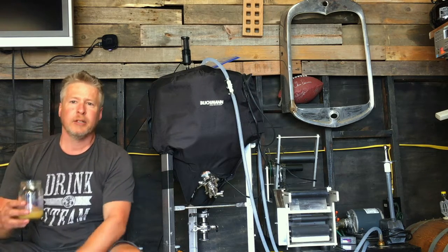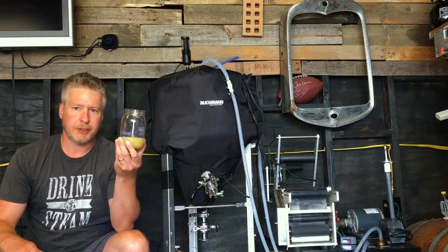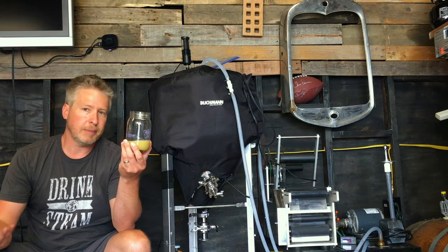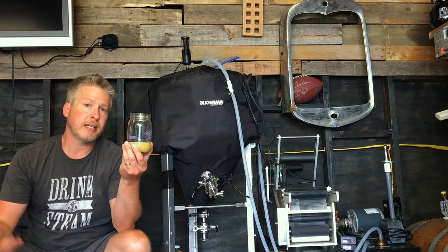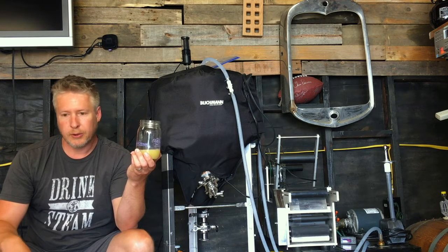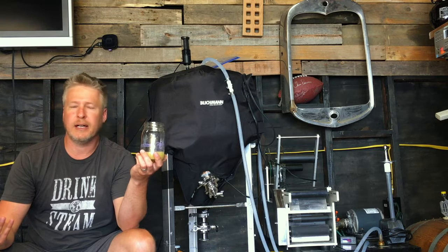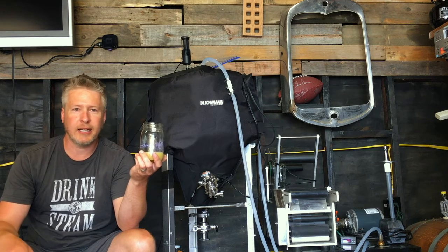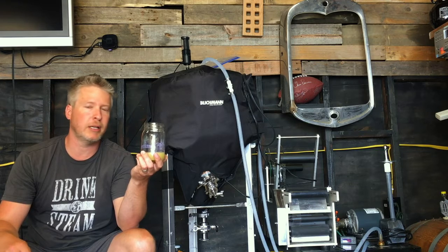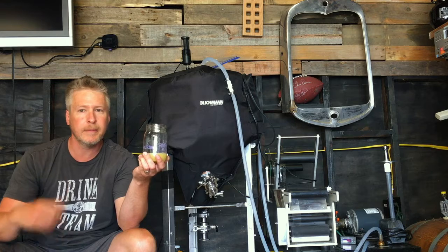So we've got our sample here. We did our temperature, and the temperature is also good to note because when we do take our hydrometer reading, there is a correction factor in there as well. So to that note, there is a lot of software out there you can get for your phones, free stuff. Brewfather is a good one. It's got a hydrometer correction in there. Plug in your actual temperature, plug in the gravity, and it'll give you that corrected value.